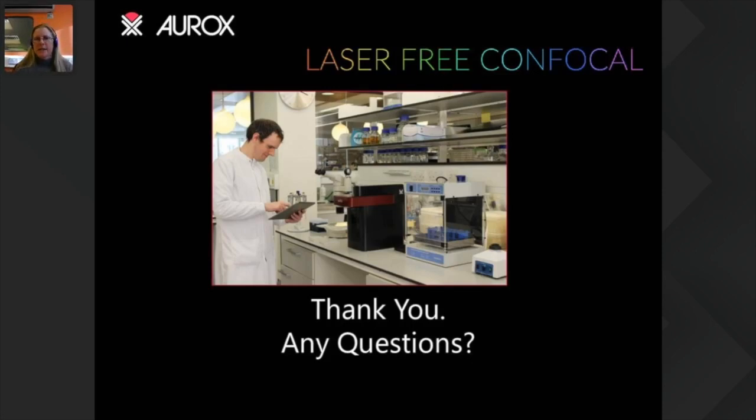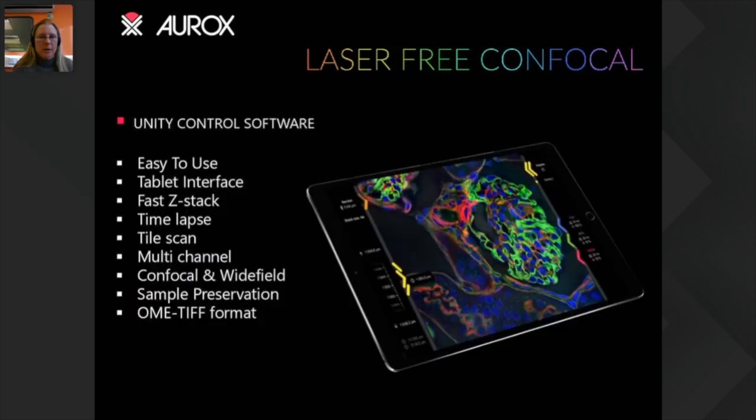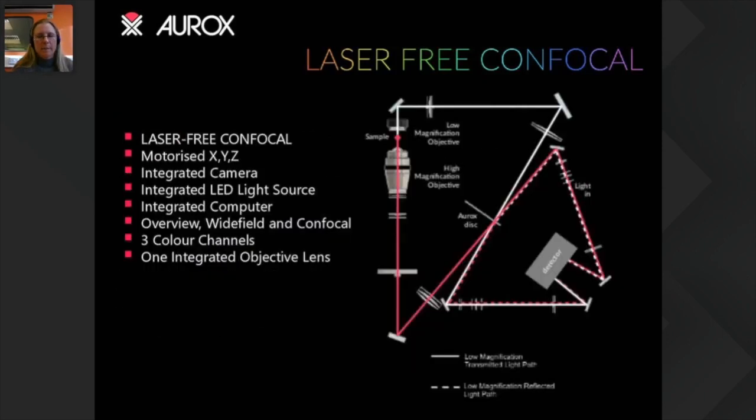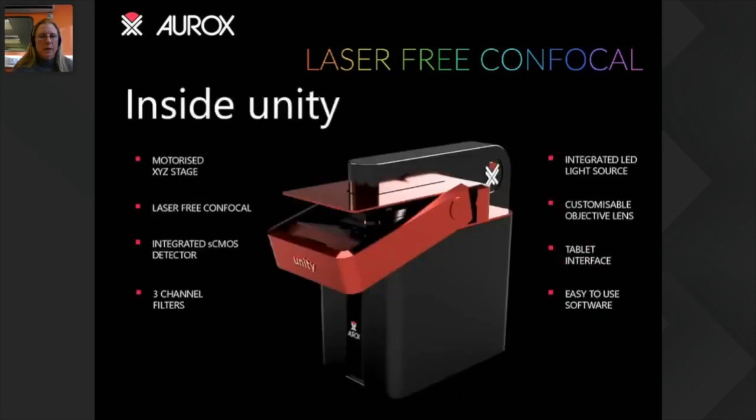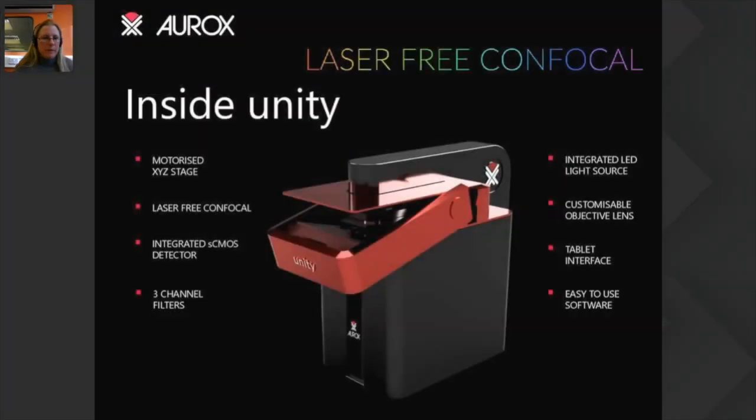There are a couple of questions I see coming up about samples. Jennifer is asking what kind of sample carriers can be used, and Mika was asking, did I explain the sample types? So inside Unity, if I go back to where it's open, we have a number of sample holders. And inside here, if I turn the whiteboard on, it will work. So bear with me.